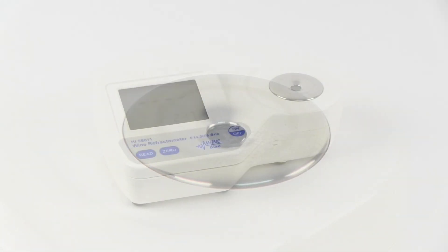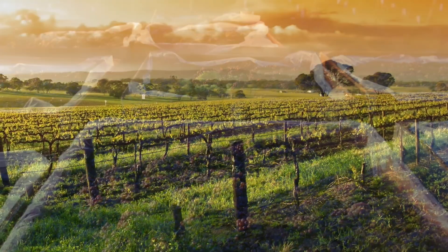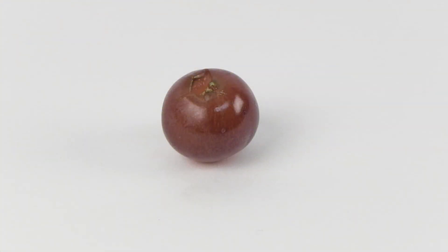Once the refractometer is calibrated, measurements may be taken. A representative composite sample of grapes in a particular growing area can be taken, or the juice of a single grape can be used to determine whether or not the grapes are ready for harvest. For this demonstration, we will use a single grape.